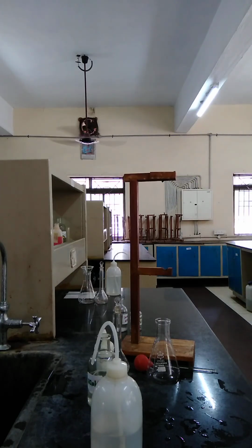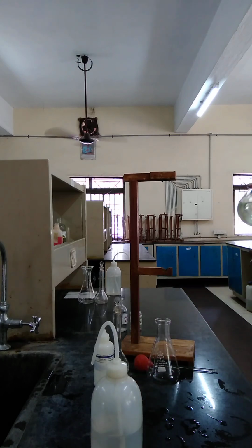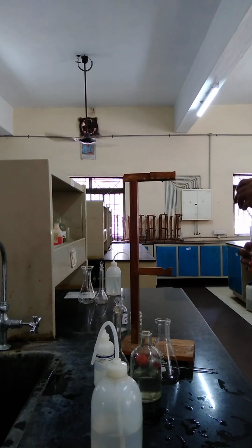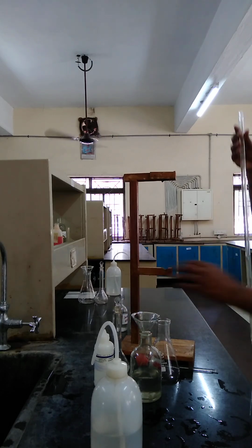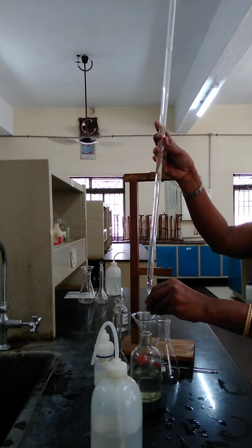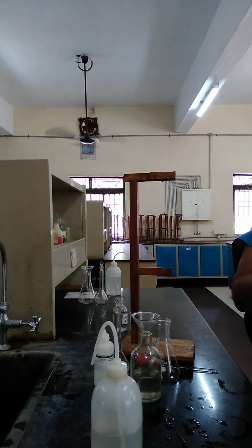But while doing the makeup, if you added excess water or left some sample in the reagent bottle, you will definitely get a wrong answer, any number of times you titrate against the sodium hydroxide. So makeup is very important. You have to do the makeup carefully. You can even take more than 10 minutes to make up, no issue.